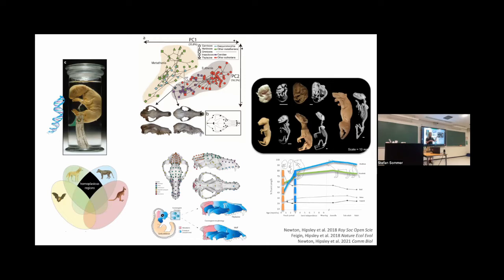So remember, these are extinct animals. They're marsupials. So sometimes when a marsupial dies, it has babies in its pouch. And in some of these few cases, when they were extirpated in the 1800s, early 1900s, some of these pouch young came into museum collections. And there were 13 known in the whole world. We worked very hard, had to make lots of museum agreements and so on to get them. And we managed to CT scan all of them.